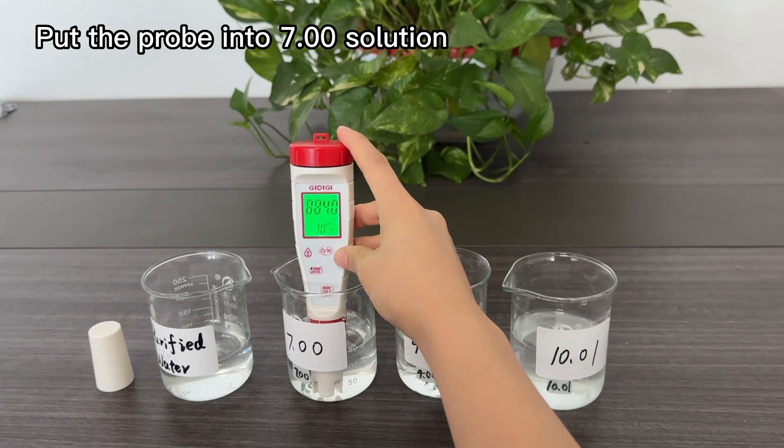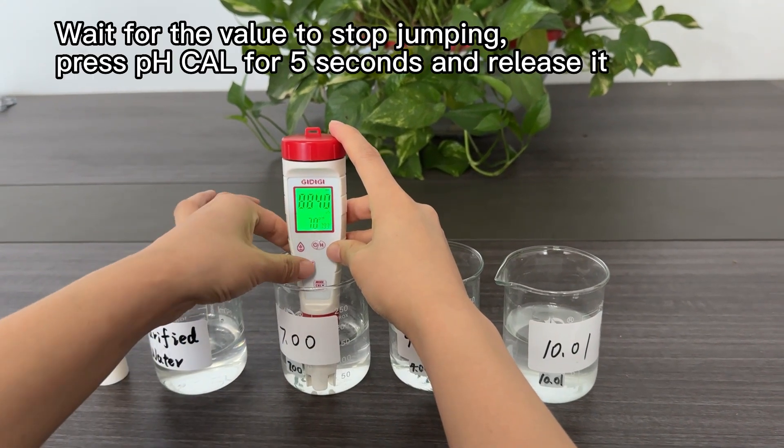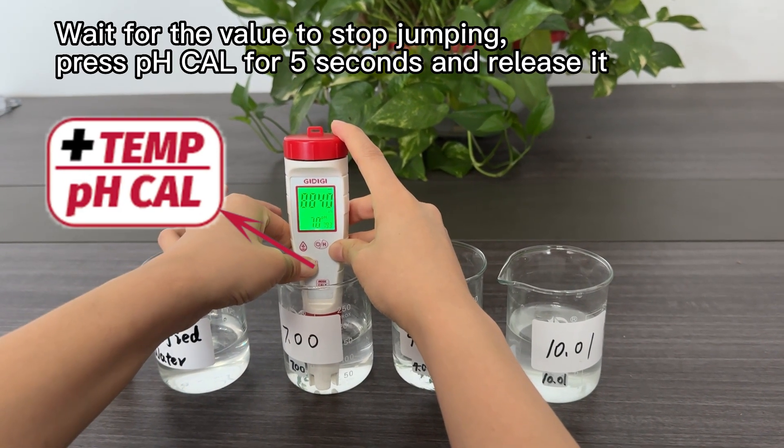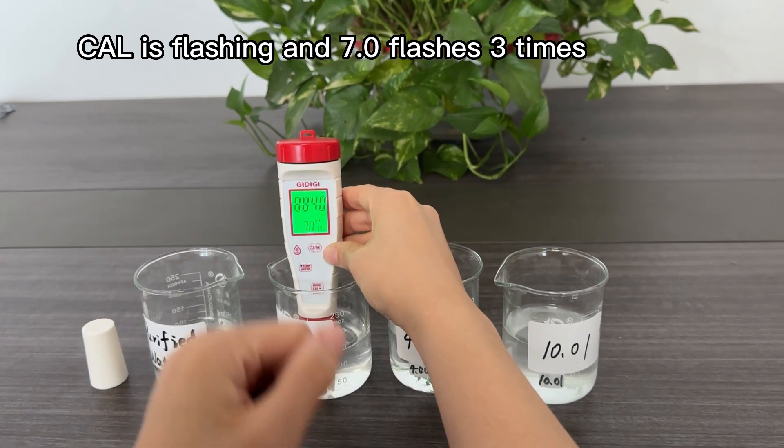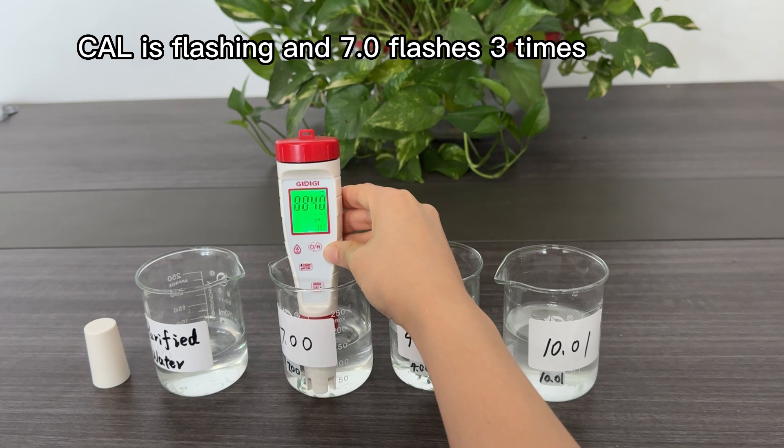Put the probe into the 7.00 solution and wait for the value to stop jumping. Press the pH calibration button for 5 seconds and release it. CAL is flashing and 7.00 flashes 3 times to confirm calibration.